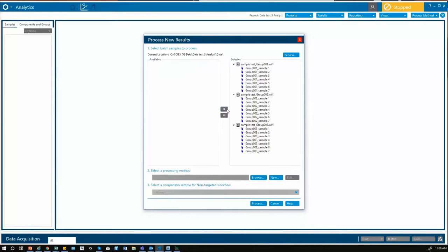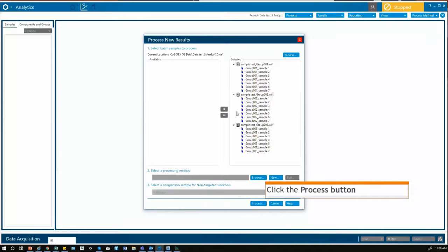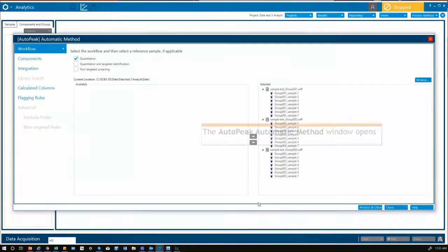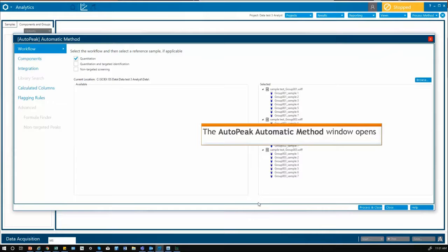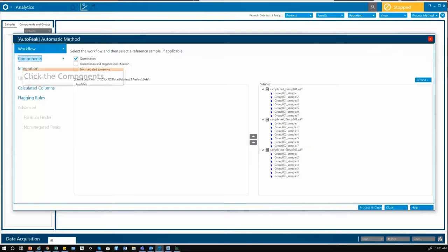After selecting your samples, go straight to the process button and then the familiar processing method pane will appear.